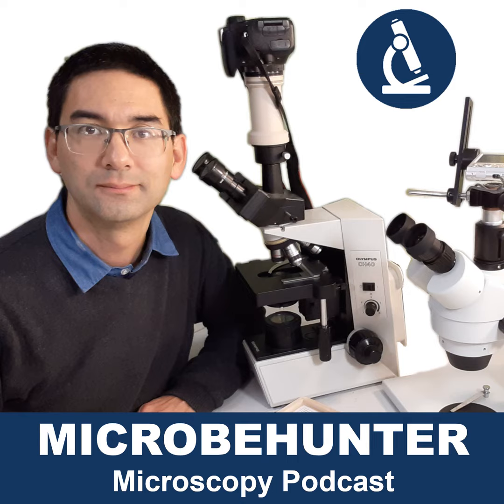I think what has happened in the last, I don't know, 20 years or so is that the big, brand name microscope manufacturers tried to separate themselves a little bit from the no-name manufacturers and smaller manufacturers of microscopes. So they've gone their own way. They have pushed their own infinity standard, and they kind of left the lower cost microscopes to the 160 millimeter DIN standard manufacturers. So I think this is something that has happened a little bit.